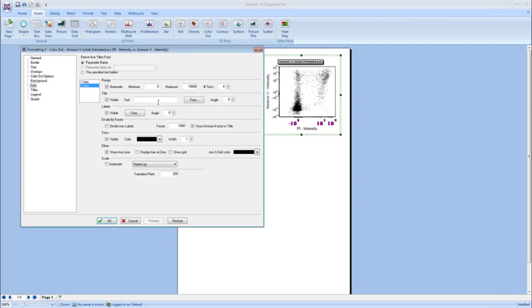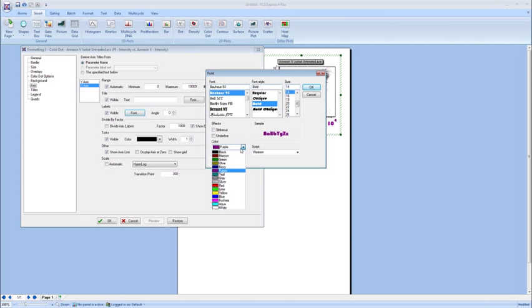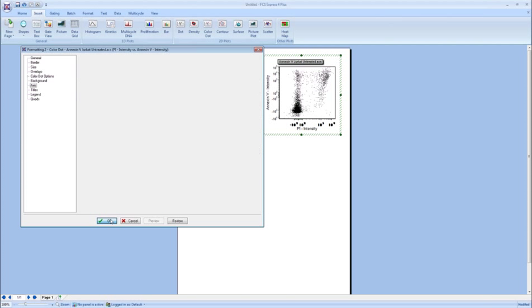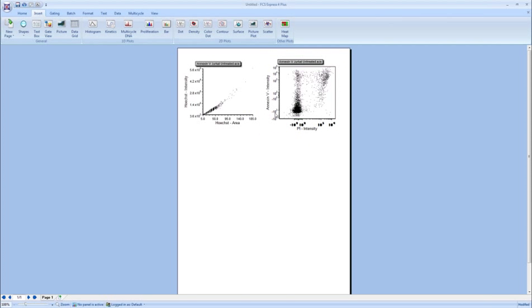Now this may seem very simple to be able to do these formatting changes, but what have you had to do in the past? To make these formatting changes in the past, what you've probably had to do is export these things to PowerPoint, put a little text box over something to white out the area, and then you're off to publishing from that point. What we like to do in FCS Express is make anything that you see on the screen publication ready, and have that available for you to export in a variety of formats.